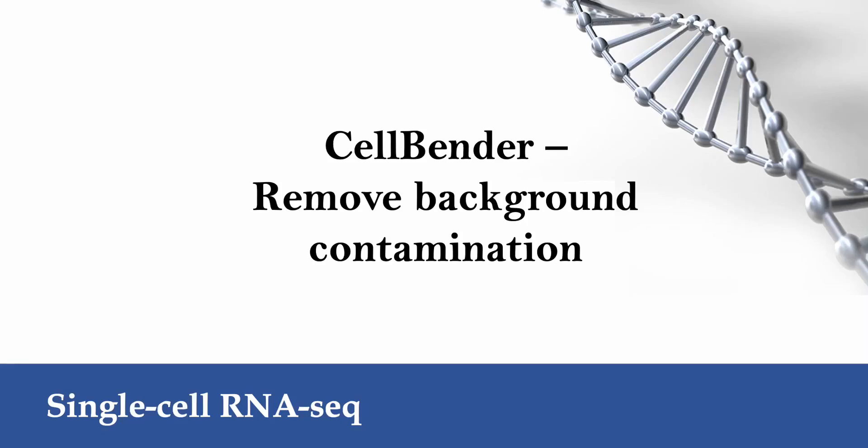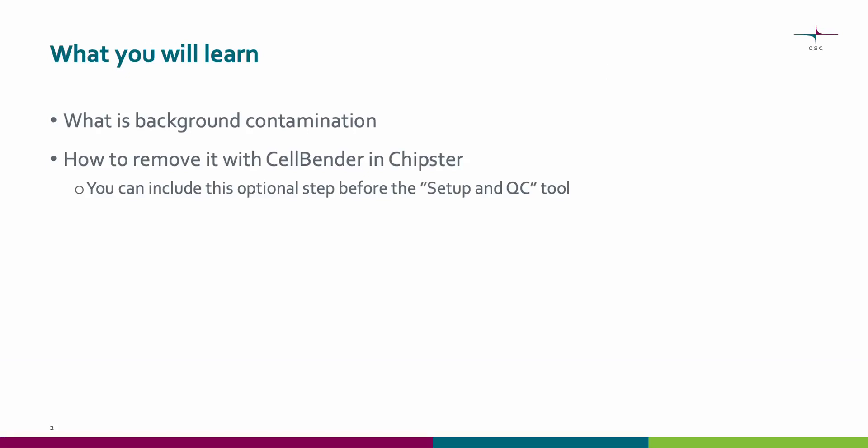This video explains how to remove background contamination from single cell RNA sequencing data using CellBender. We will learn about background contamination and how to remove it with CellBender in Chipster.